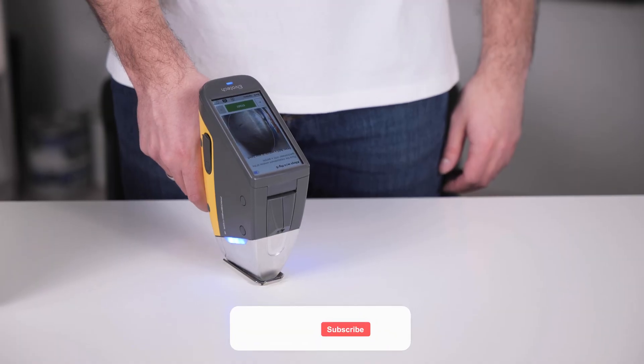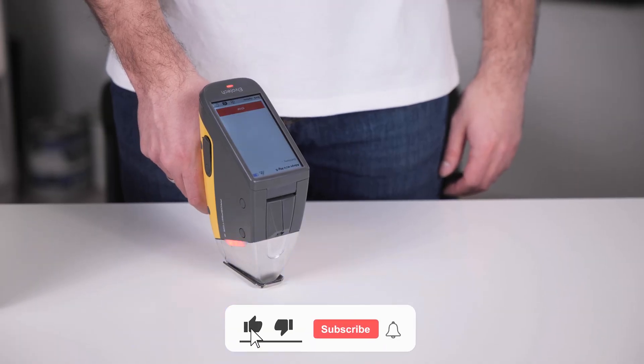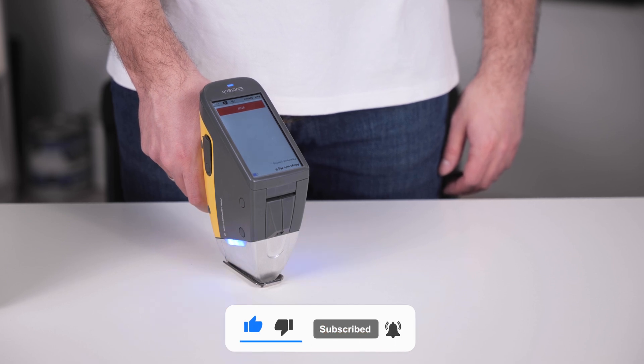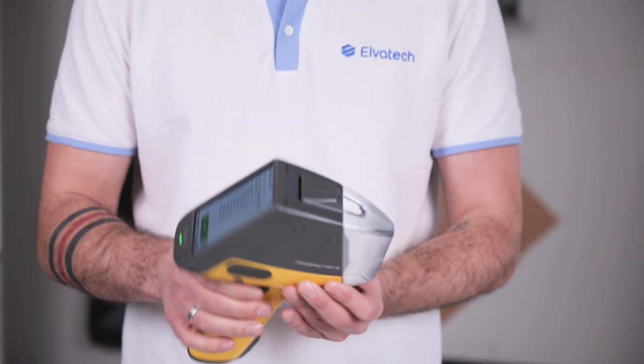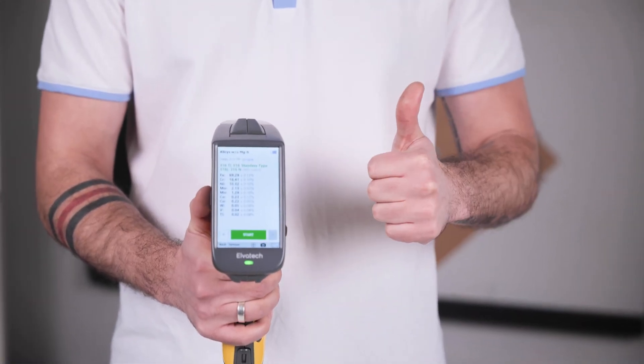Always perform an initial diagnostic test after turning on the analyzer and just before operating it. Analyze the test samples that come with the analyzer and compare the measurement results with the data on the calibration certificate. They should be identical.